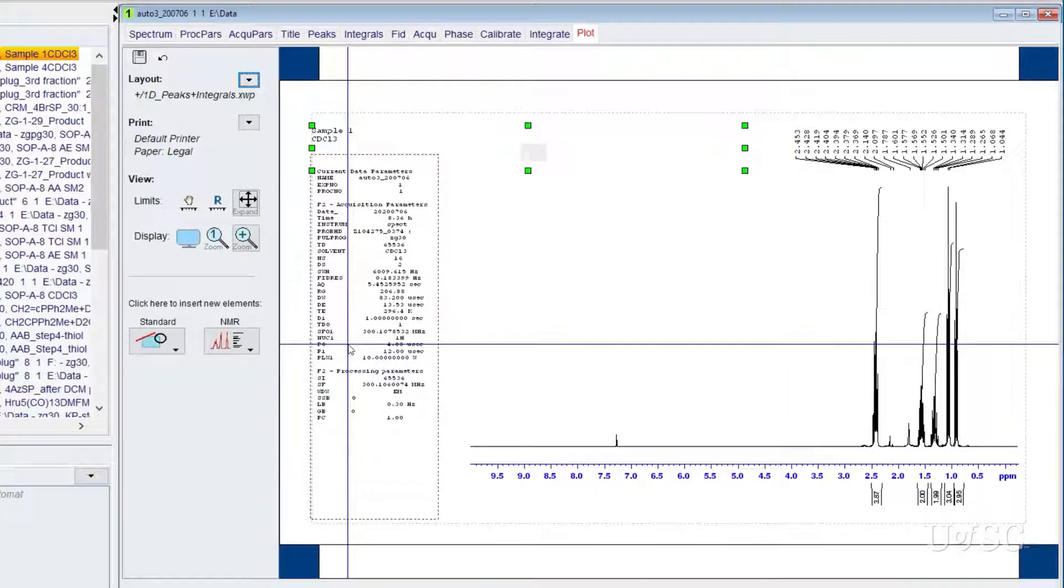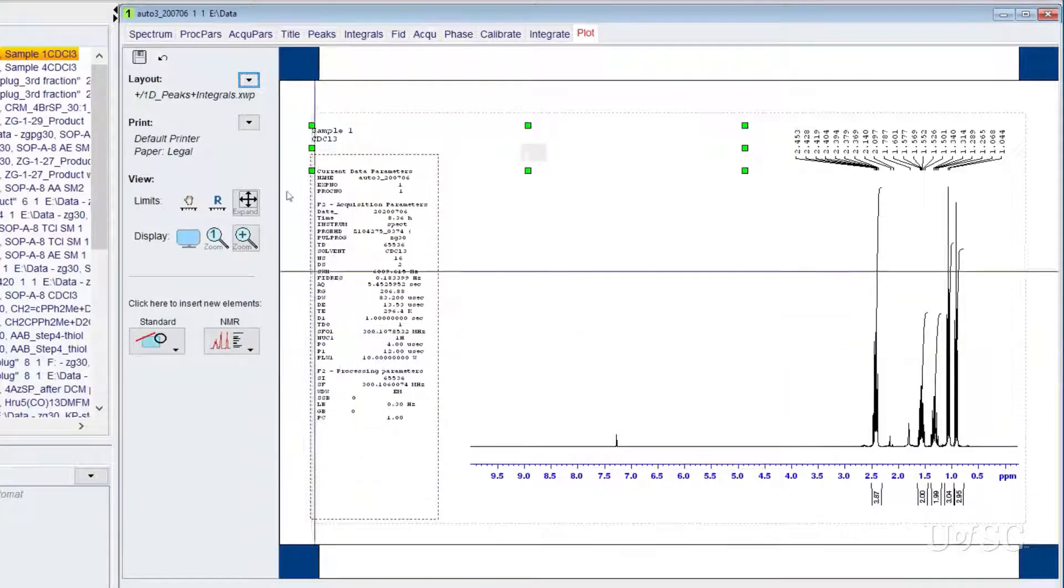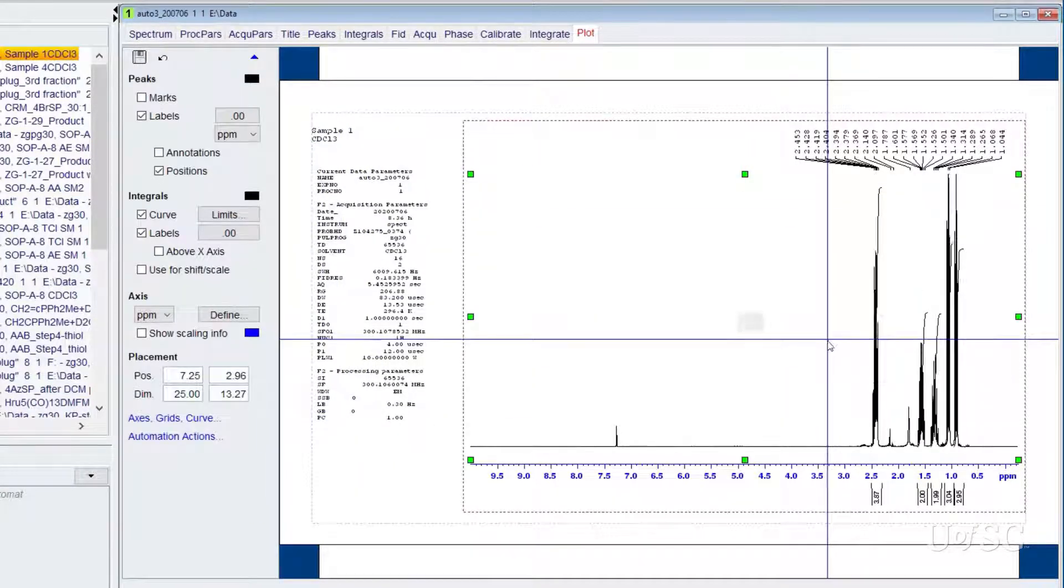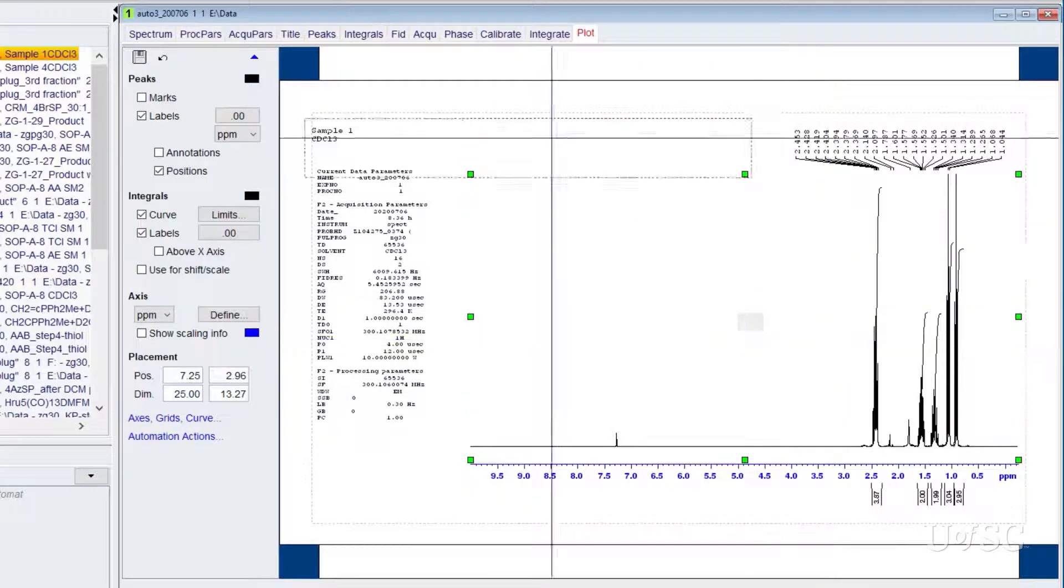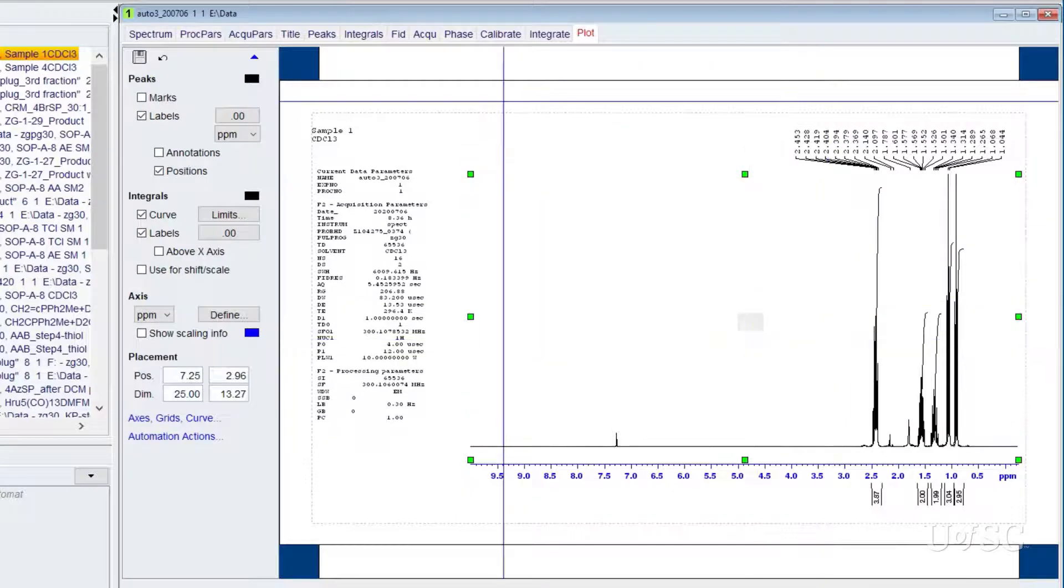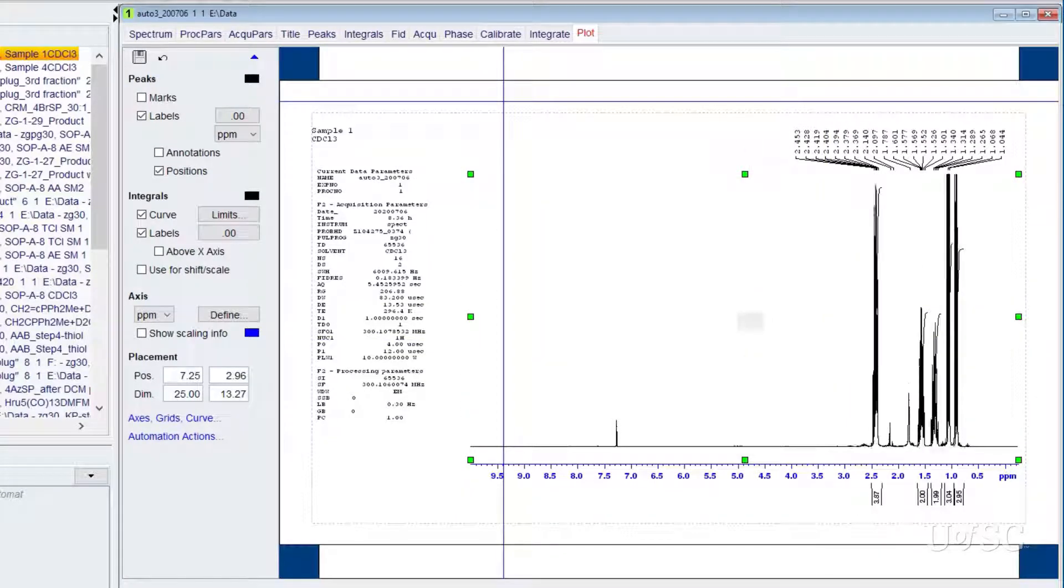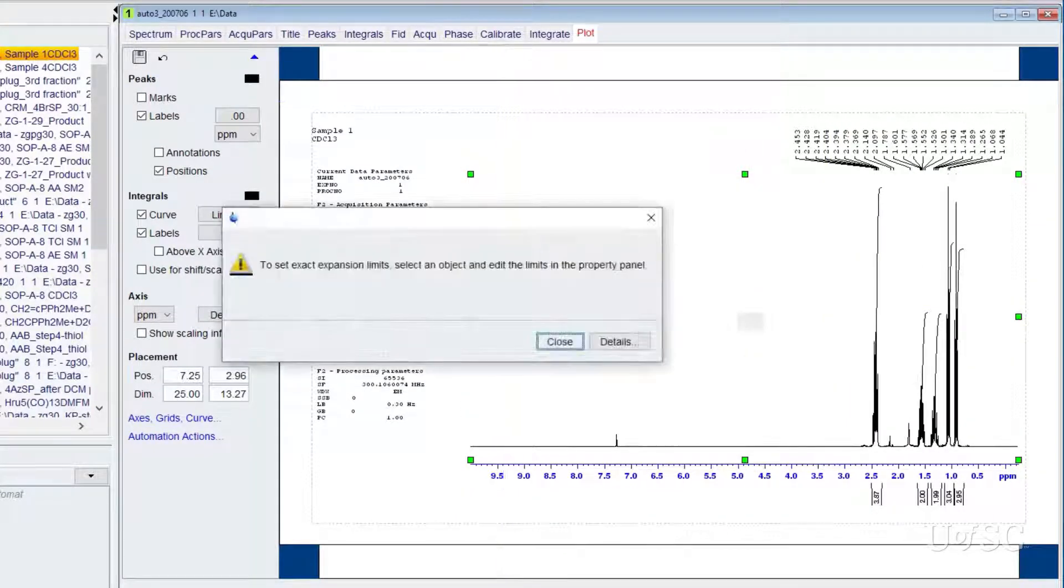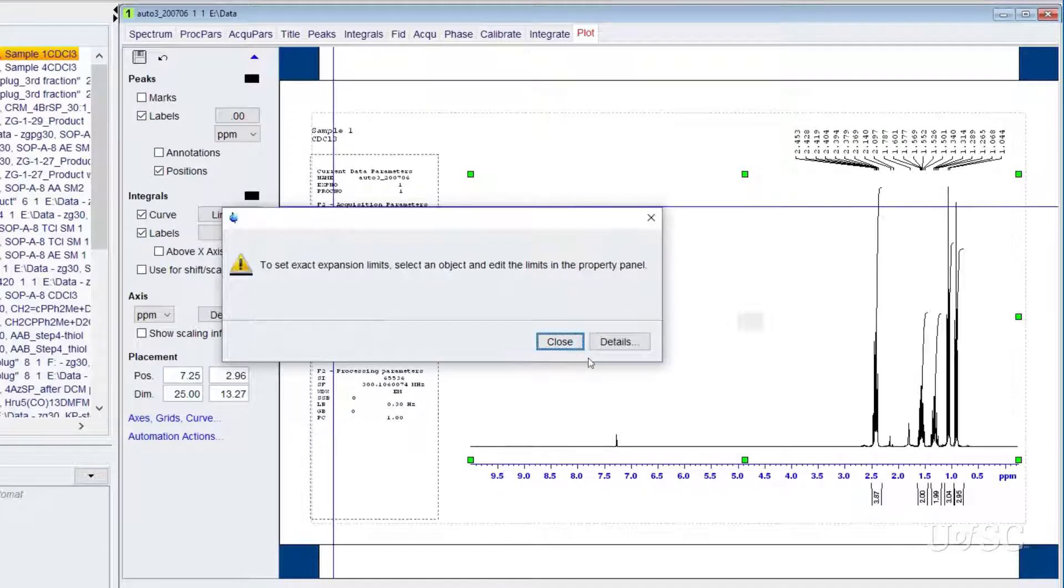you can use the mouse scroll wheel or the button bar to adjust the vertical scale. However, you cannot use the tools to adjust the chemical shift scale so you should make this choice before you enter the editor.